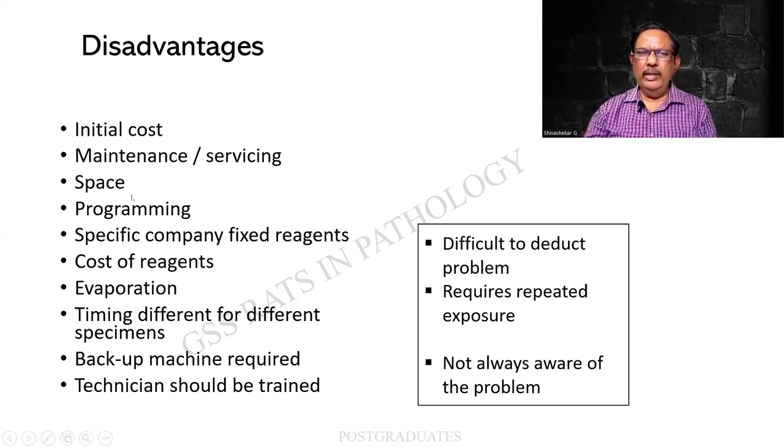Space, though it is small, some amount of space is required in the laboratory. Programming, therefore: there is software now, and that has to be programmed well. And we will have to procure the reagents from a specific company and not compromise on it. This again can be a little cost oriented. Evaporation can lead to loss of the reagents.